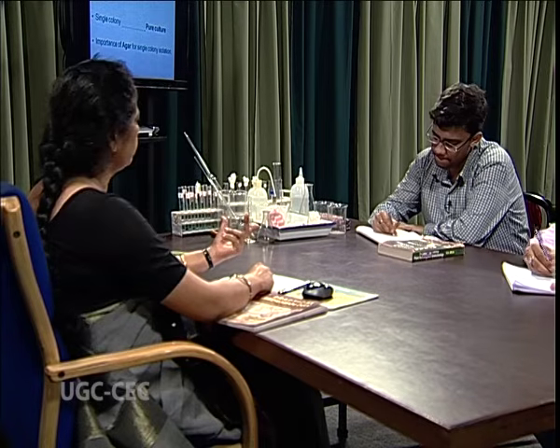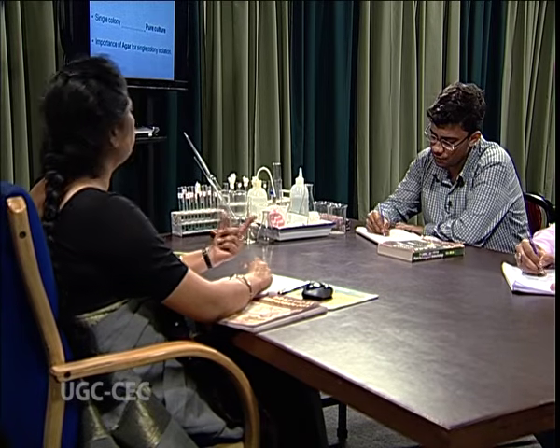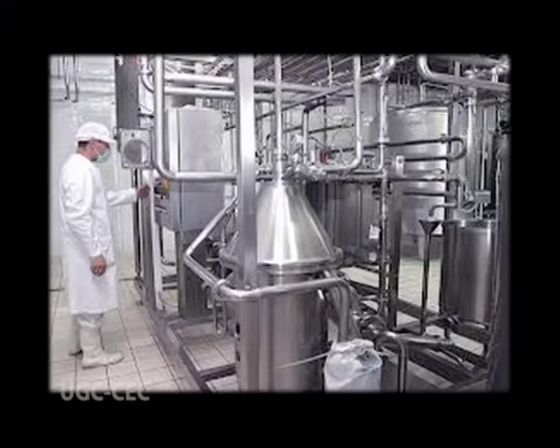Now, isolation of a single colony on the agar media is very important because we want to prepare a pure culture. Pure culture means a culture which is made from a single type of bacteria. The importance of the pure culture can be seen very well when we use this culture in industry.